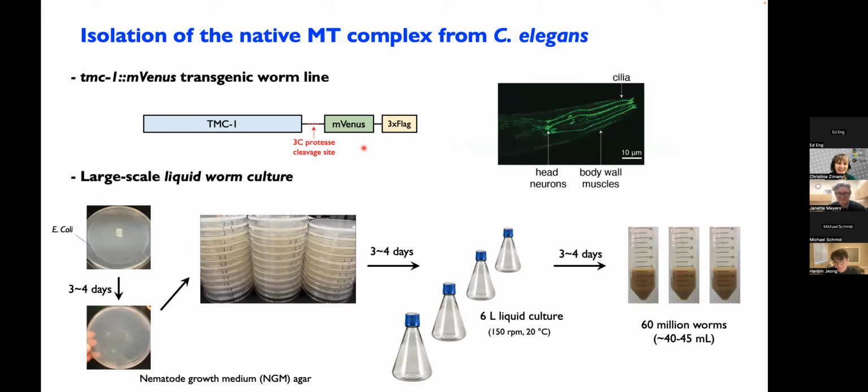Yeah, and actually, if I can ask a related question, do you do any fluorescence imaging on the whole worm before you start your prep? Or are you only starting to use the fluorescence at the FSEC stage? Oh, I did before this, before isolating TMC1, to see where the translocation is in their place.